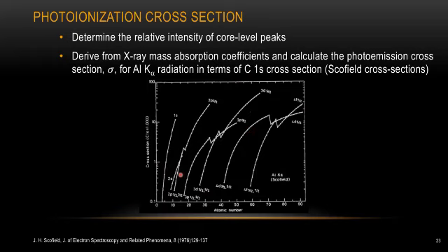Based on the graph, you can see light elements usually give you a lower cross-section number. For heavy elements, you usually have a higher tendency for electrons to come from a higher orbital shell than an inner orbital shell. That's all based on the photoionization cross-section.